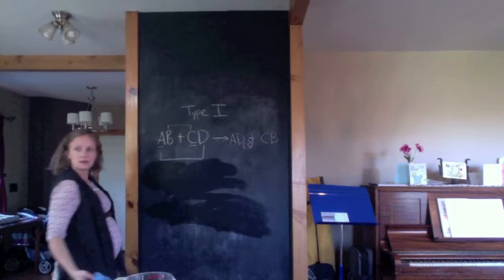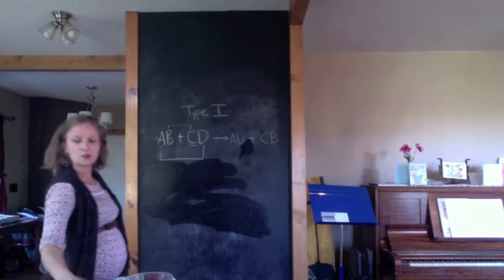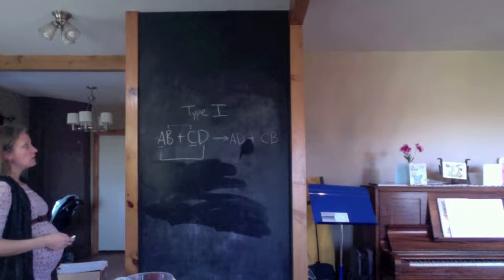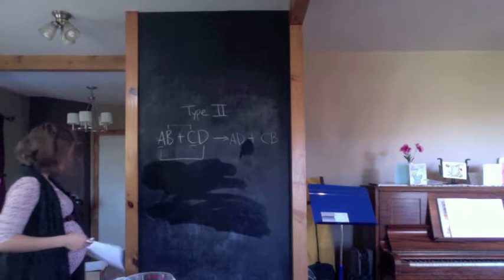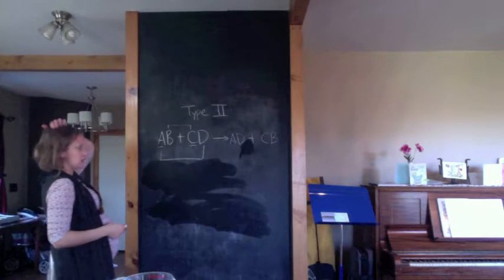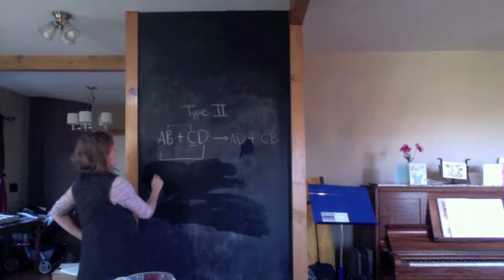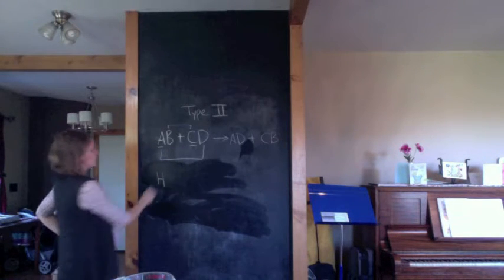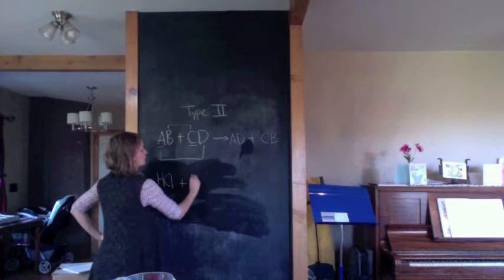It's still based on the same concept of the ions swapping places. So I'm going to leave this demonstration here. Now, type 2, acid-base, always has to involve an acid and a base. So the acid we can identify because it always has hydrogen written first. So the cation is hydrogen. Let's use the most popular acid-base combination, hydrochloric acid, HCl, plus sodium hydroxide.